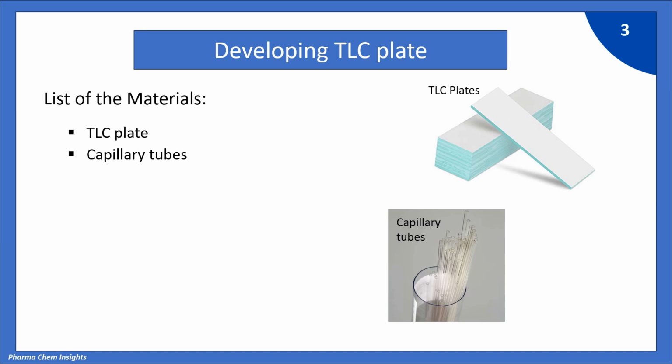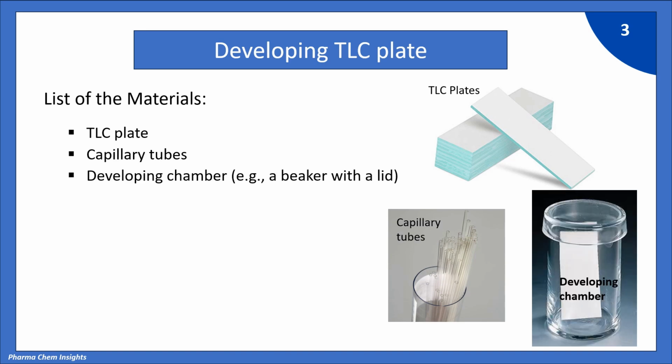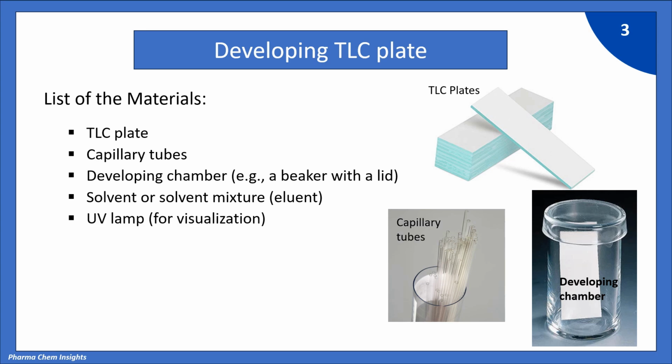Second is capillary tubes. Third is developing chamber. Fourth is solvent or solvent mixture, also called as eluent. Fifth is UV lamp for visualization of spots. Sixth is pencil, ruler and forceps.